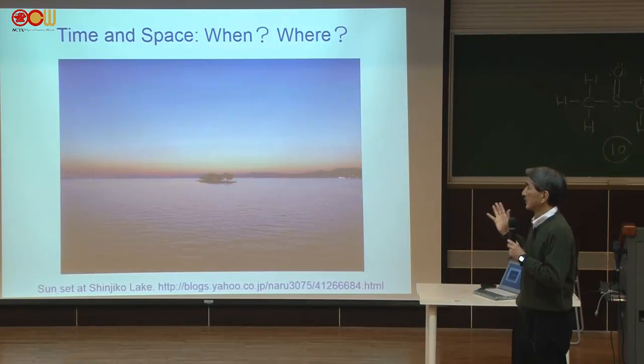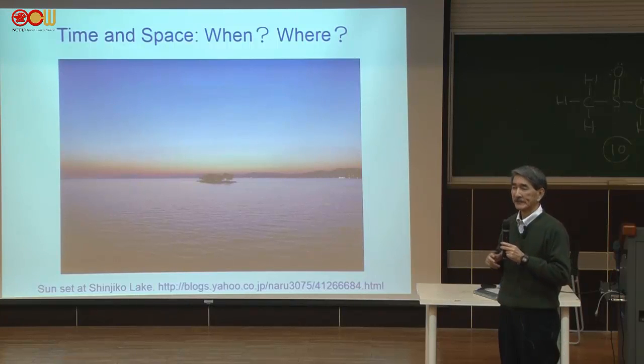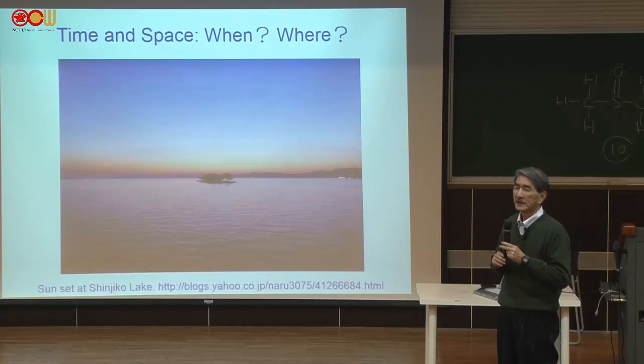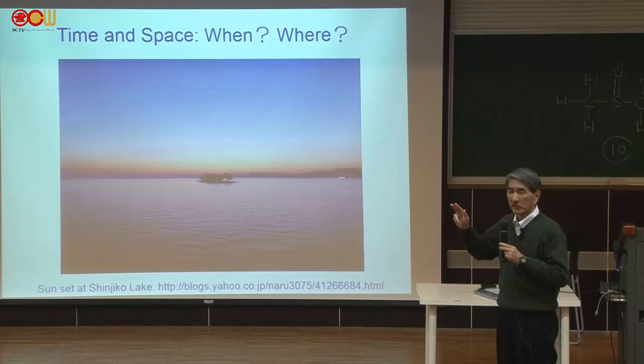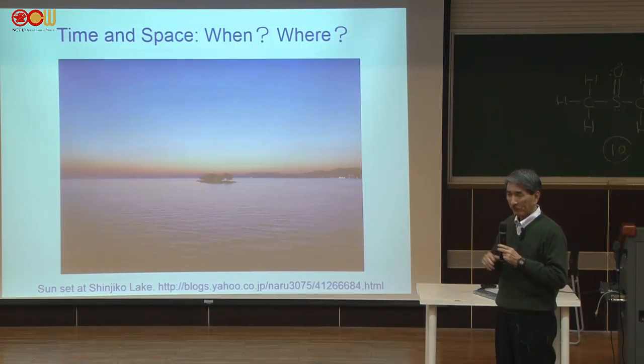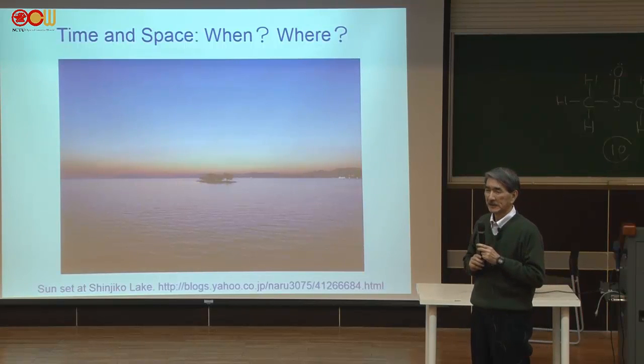So the time resolving is very important to see something important. In the case of time-resolved Raman spectroscopy, we want to see the molecule doing some reaction or something. So when the molecule is in action, we want to see it. So this is like a stopped motion picture.